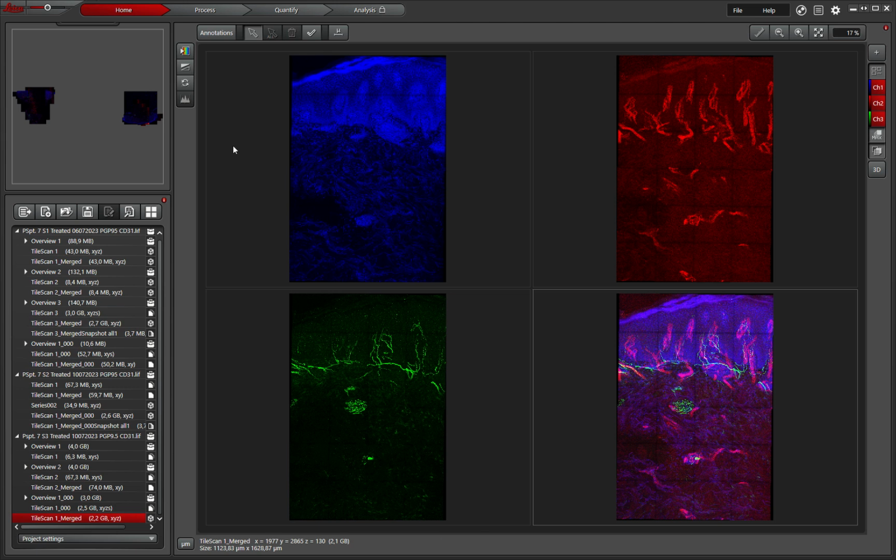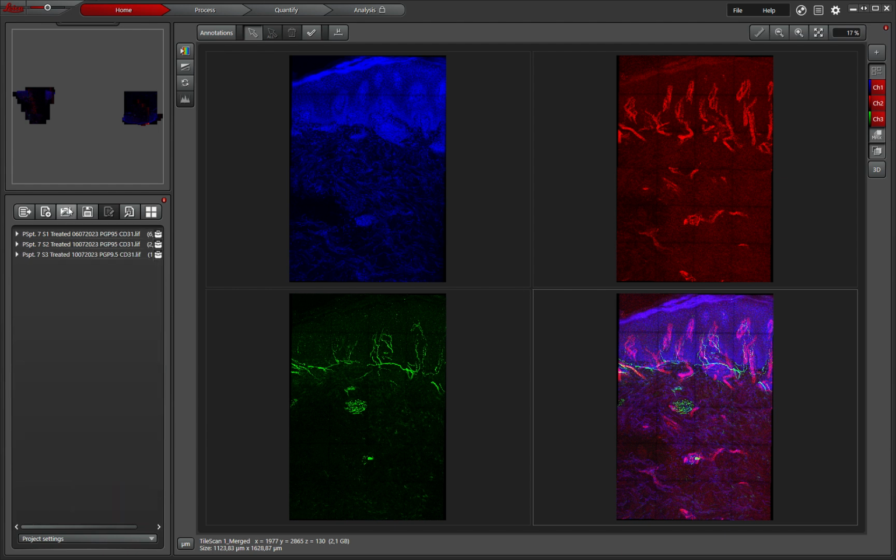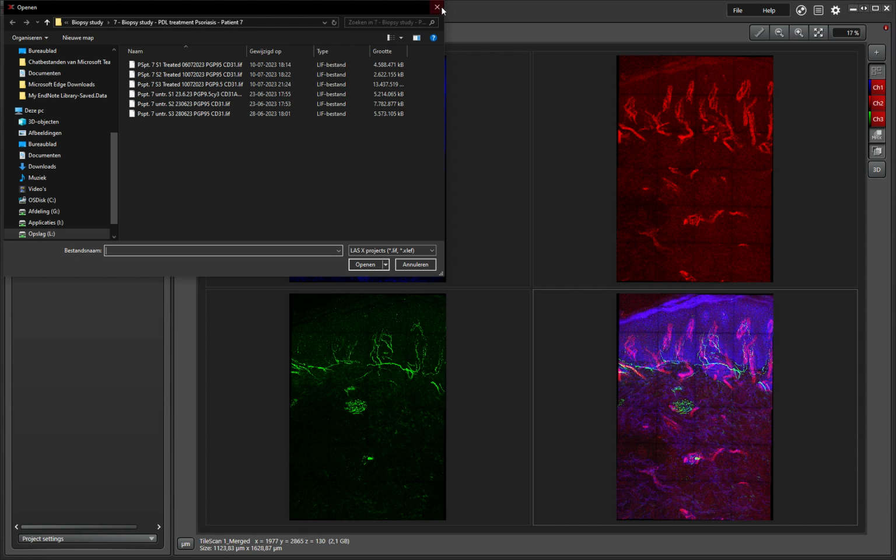Okay, welcome. I'm going to show you today how to export your microscopy images into IMARIS, because there's a lot of tiny steps that are important in this and that can go wrong, and then you end up with not a 3D image but a strange format for IMARIS. So you load your images. You do that via this button, in case you didn't know. You load them.